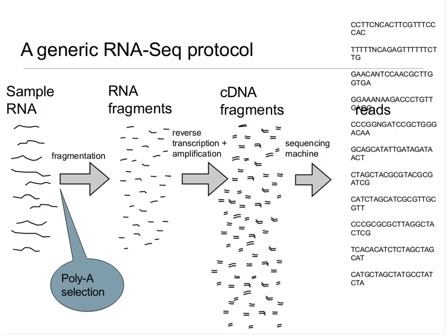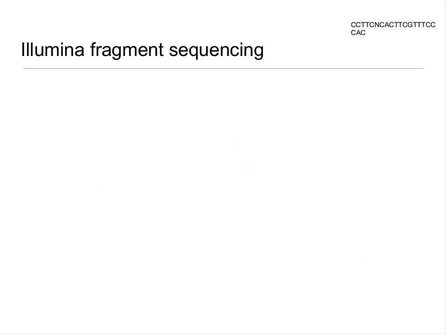There are a number of other protocol steps that can be added here, depending on the application. One might be to do poly-A selection near the beginning, which will restrict your analysis to only those transcripts that are polyadenylated, which is typically the protein coding fraction of the transcriptome. There might also be a size selection step near the end, which restricts to those size RNA fragments that you're interested in. Typically, those are restricted to maybe 200 to 300 base pairs in length.